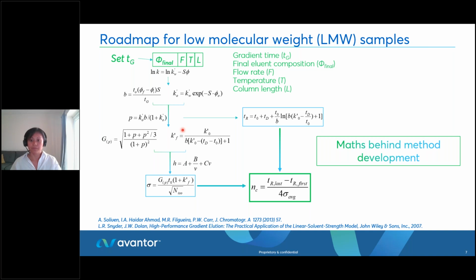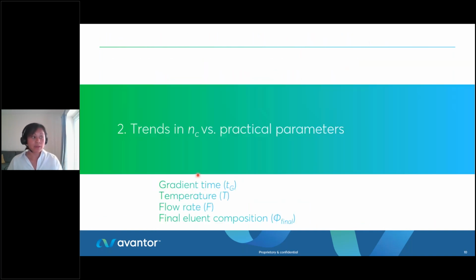If later down the line before validation, you need to change the assay, for example, to create a method for higher throughput, how would you advise the use of this practical guide? That's a good question, and that's pulling us in two directions, because as chromatographers, as separation scientists, we know that flow rate is really the driving aspect for throughput. The good news for small molecules is you want to drive that as high as possible. For larger peptide molecules, you need to do systematic experiments for velocity.